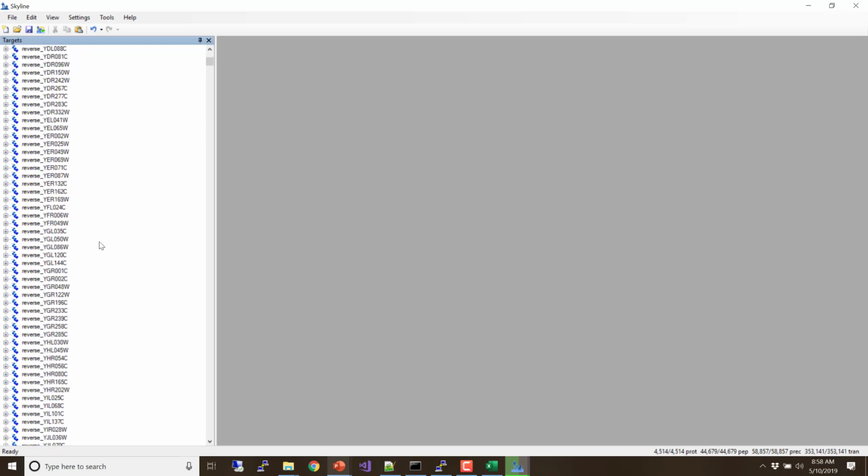And now that groups all the reverse underscore proteins together. And we get some above it, so let's move those down. So click on this Q004.